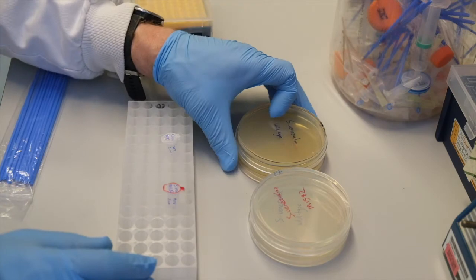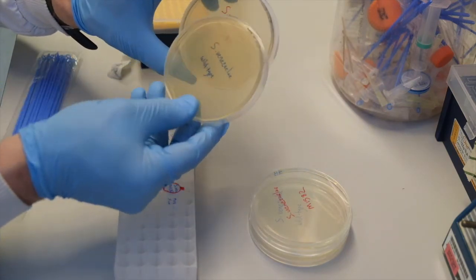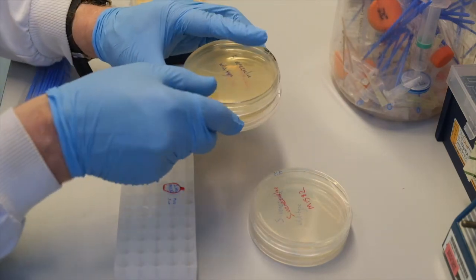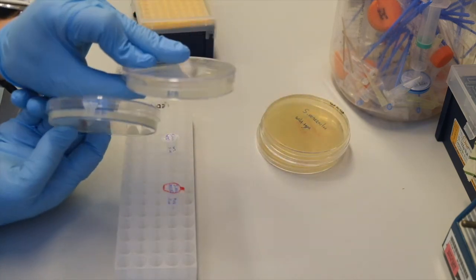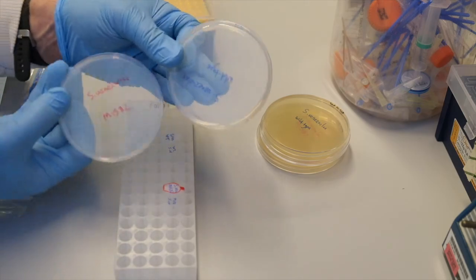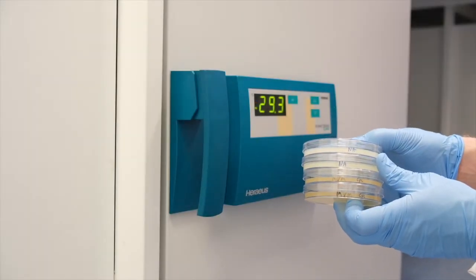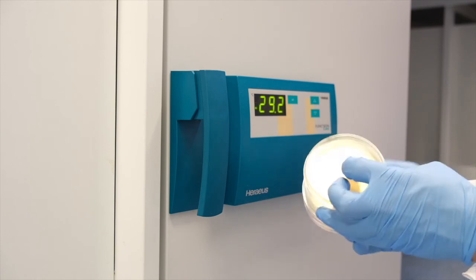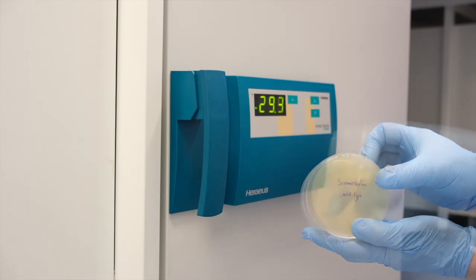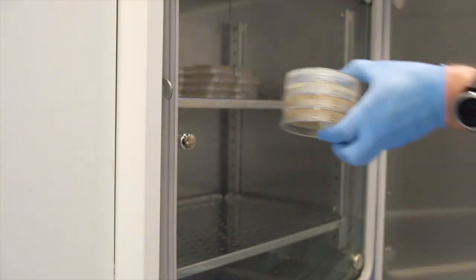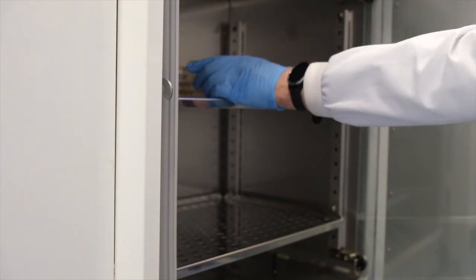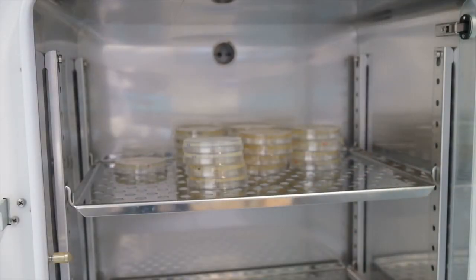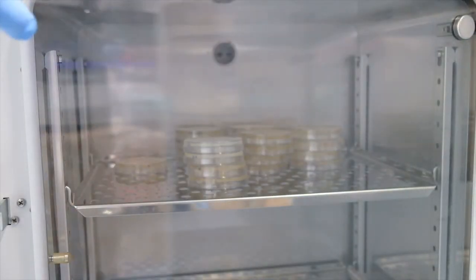We have now spread both strains of Streptomyces venezueli on MYM plates to sporulate and streaked both strains on nutrient agar plates to form single colonies. All plates will be incubated at 30 degrees. The MYM plates will be incubated for 5 days to allow the Streptomyces to sporulate. The nutrient agar plates require only 2 days of incubation to form single colonies.